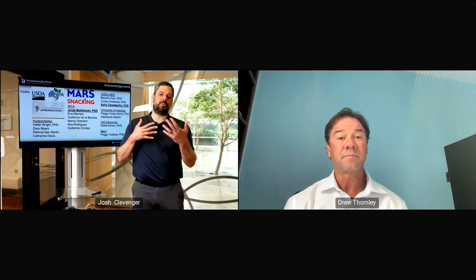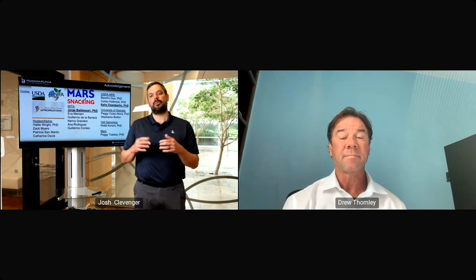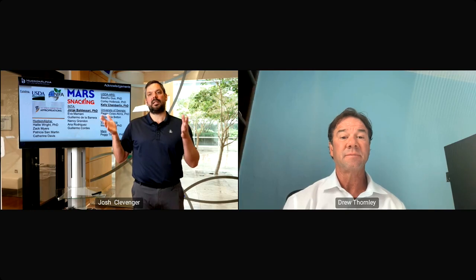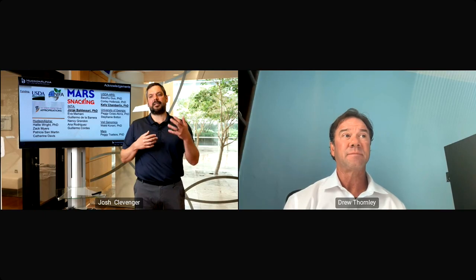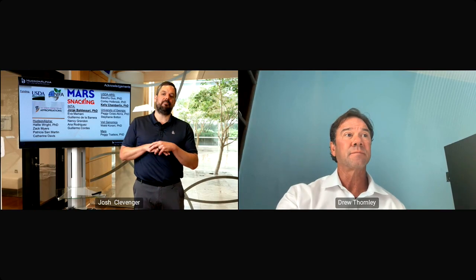So whatever system you're working on, whether it's less than that or more than that, you can create your pangenome based on the founders in your neck of the woods. And as I showcased in our work, that becomes amazingly impactful.